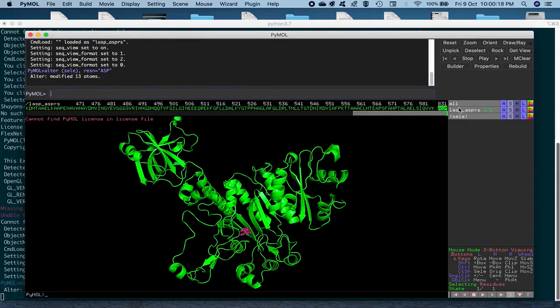So, you see the change happening there. It was AMO before and it has changed now to ASP. So, we have the desired residue name that we wanted.